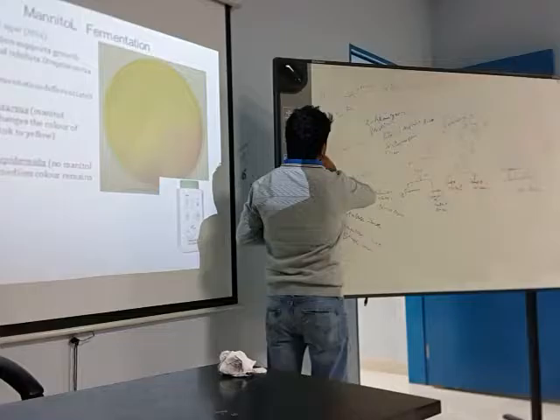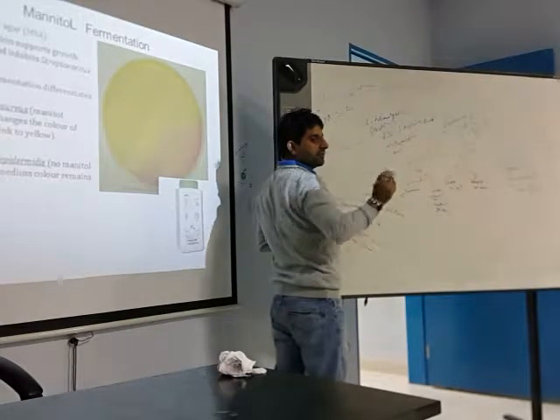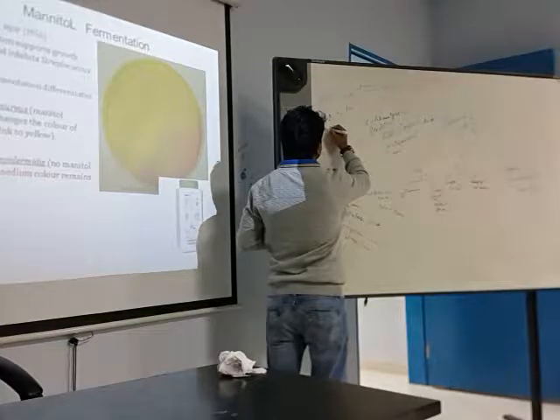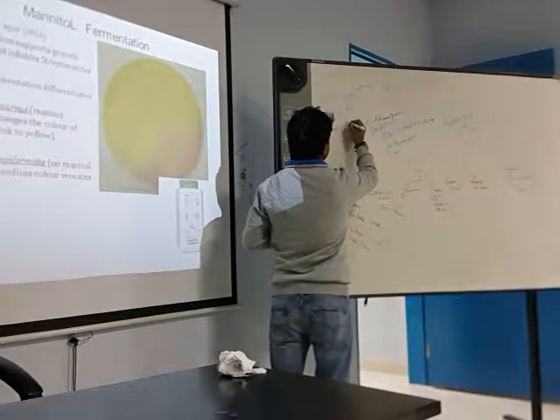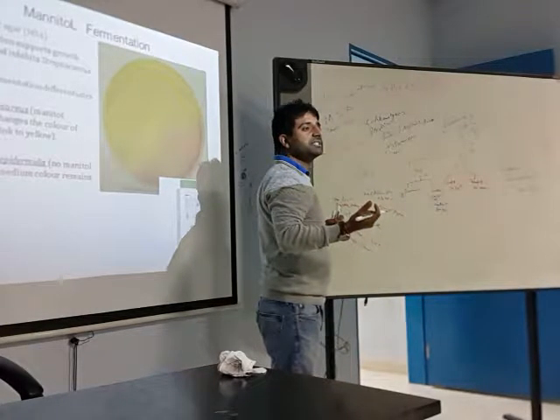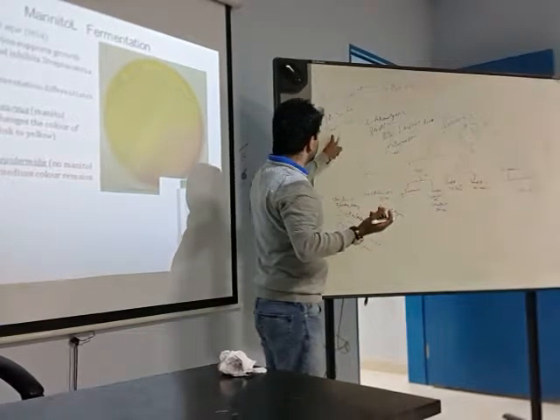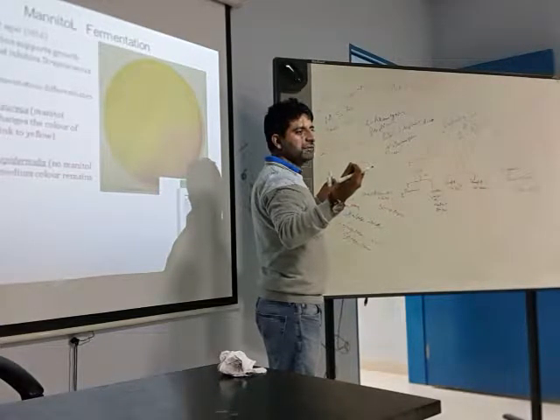What is mannitol? A sugar. So we will see if the bacteria ferments this sugar; this means it is Staph aureus.